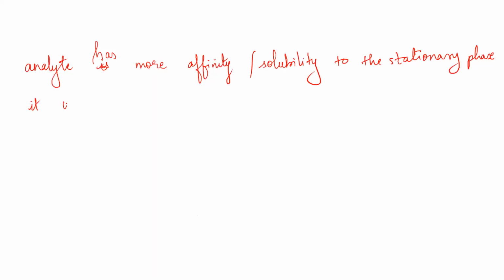If your analyte has no attraction towards the stationary phase but has more solubility in the mobile phase, then it will come out quickly in the mobile phase. Did you understand this concept? Yes. Okay, not only Anushka, others also. Have you all understood what I'm saying?